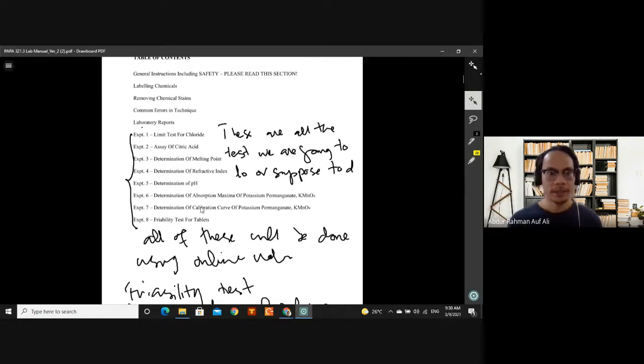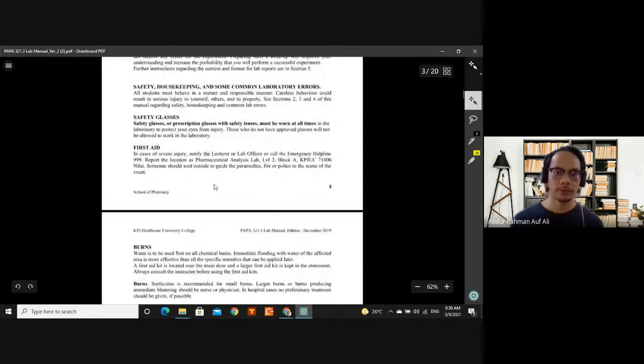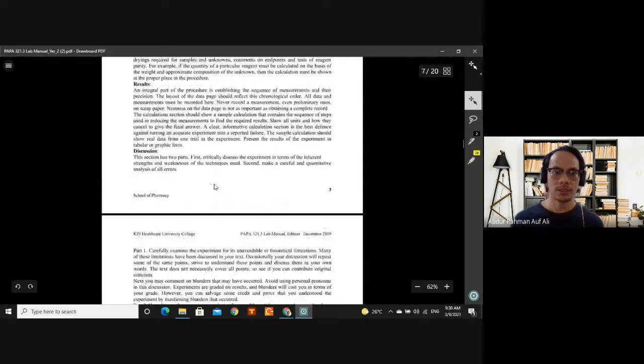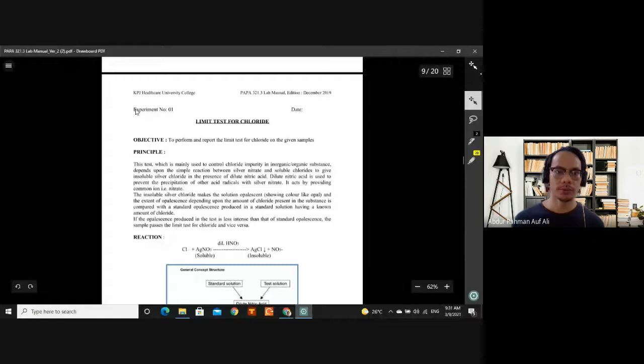Right? So the first is limit test for chloride. So dalam this, if you go scroll down to the page, mana dia tulis. Okay, so dekat sini limit test for chloride. Sudah kat dalam sini ditulis semuanya, semua info.